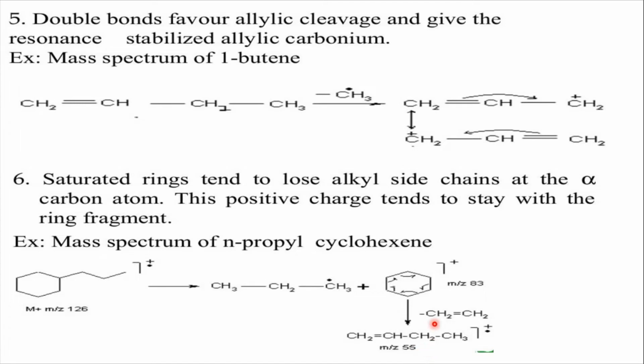So the cleavage of this saturated ring occurs, and again there is a formation of a new fragment. So it is also an important one. Saturated rings tend to lose the alkyl side chain at the alpha carbon atom. This positive charge tends to stay with the ring fragment.